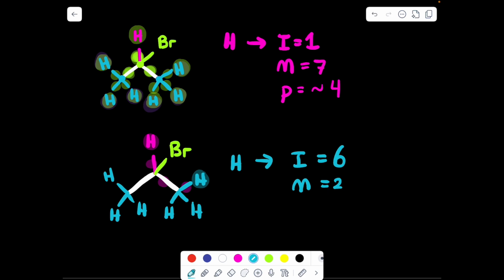And now for the ppm. The ppm of these blue hydrogens, well, they're on a blue carbon, and this blue carbon is not attached to anything that electronegative. There's no electron withdrawing group directly on the same carbon as any of these blue hydrogens, so they should be quite electron rich. And CH3 groups usually appear, if they're electron rich, from 0.5 to 2 ppm at max.